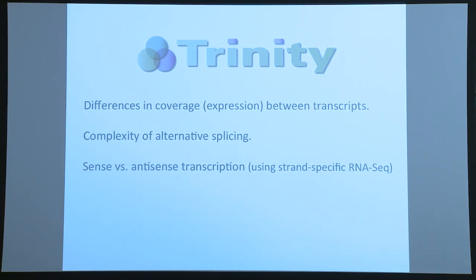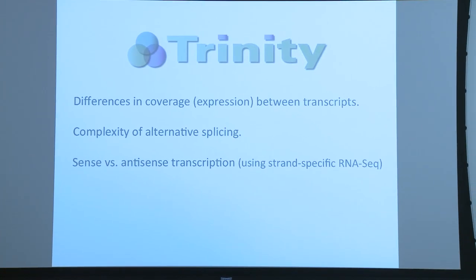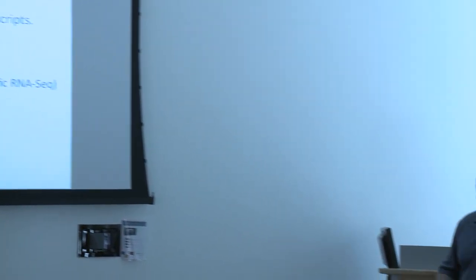So when you generate your RNA-seq data, you have an option where you can generate your data in a strand-specific way to retain that strand information. And that's really key if you want to be able to study things like antisense transcription, which is an important process in regulating transcription, regulating gene expression. Without that, you can still reconstruct transcripts, but it's not obvious. You don't know necessarily that it's coming from the antisense versus the sense, especially when you have long single exon genes. So we took all this information into account in building our software tool.